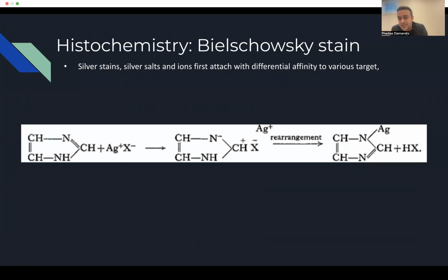And the important difference here is that these should not be thought of as dyes, because the substance is clear, unlike the eosin and hematoxylin that we saw was pink and purple. Silver stains are actually clear, so they do require a reducing step to convert that metal into something that can be visualized under the microscope.